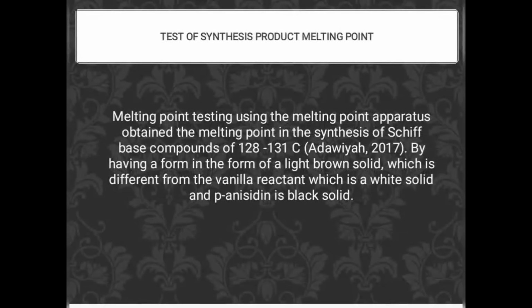Test of synthesis product melting point. Melting point testing using the melting point apparatus obtained a melting point for the synthesis of the Schiff base compound of 128 to 131 degrees Celsius, in the form of a light brown solid, which is different from the vanillin reactant, which is a white solid, and p-Anisidine, which is black.